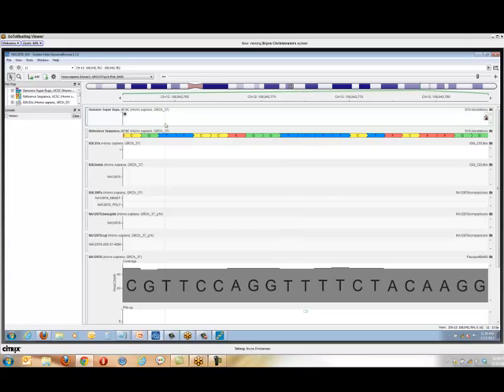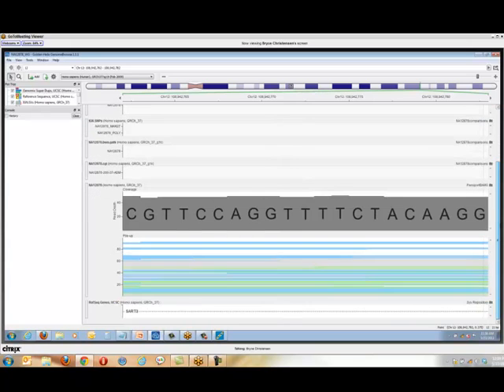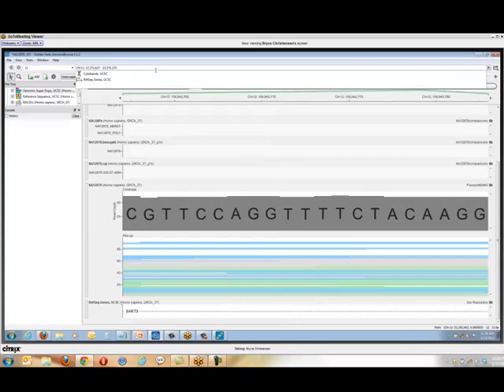Some of these, well, actually they're all on an external hard drive that I've got plugged in by USB, and they aren't going to read and update really fast, so hopefully we can make this work well. So the first thing I want to look at, let me copy this position, is a structural variant. In fact, it's an inversion polymorphism.